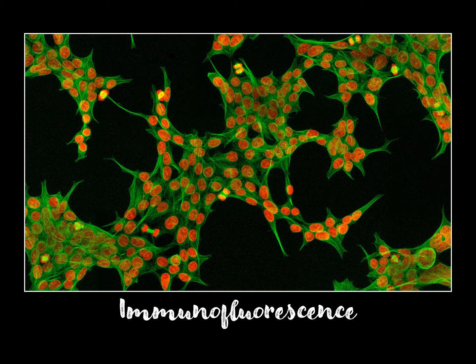My name is Shirsha and in this particular lecture series we are going to talk about one of the most commonly utilized methods for visualizing cells and molecules within the cells under microscopy, and that is immunofluorescence. So in this lecture series, we are going to have a couple of short videos in which we are going to talk about immunofluorescence and immunohistochemistry and cytochemistry. And finally, we are going to discuss FACS or fluorescence assisted cell sorting.